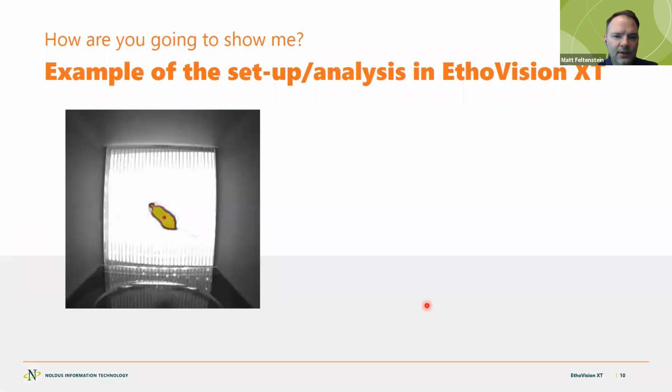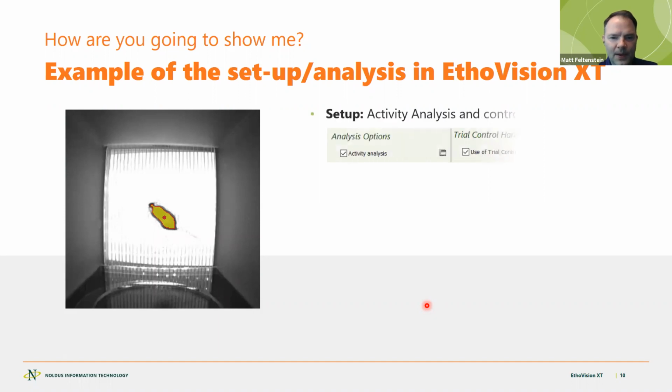So how am I going to show you this? Basically, I'm going to move out of the PowerPoint. We're going to go into the EthoVision XT software, and I want to show you the setup and how you can do this. Primarily, I want to show you two things that are really important when you're setting up a fear conditioning experiment.